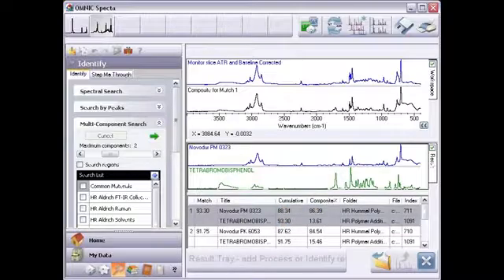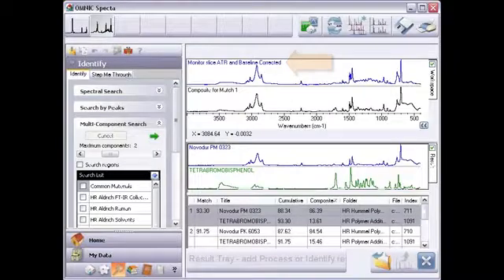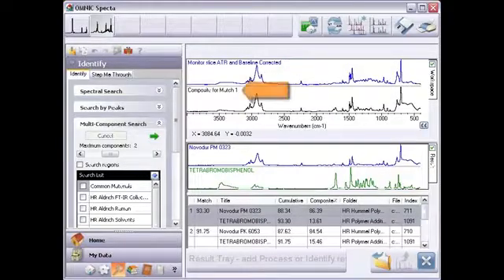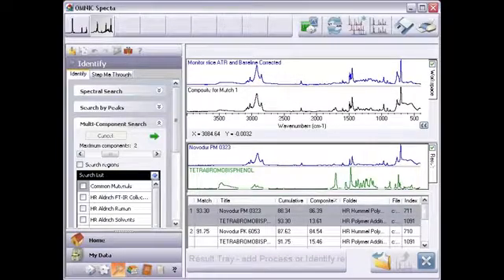My unknown spectrum is still in the workspace pane. The other spectrum in the workspace is the composite spectrum for the first match. The composite is a computer generated spectrum that represents the found reference spectra with absorbance values adjusted to approximate the relative amounts present in the unknown sample.